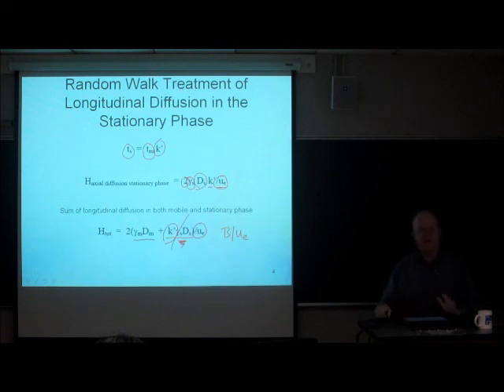But in LC, the mobile phase is a liquid and the stationary phase is liquid-like, and so you can't say one is necessarily a lot different than the other. And in LC, we have to deal with both of these processes.